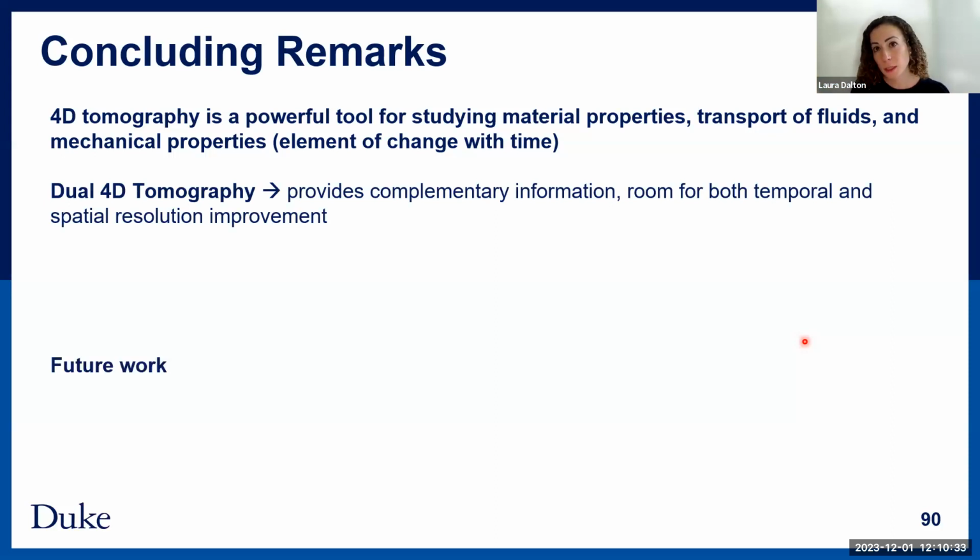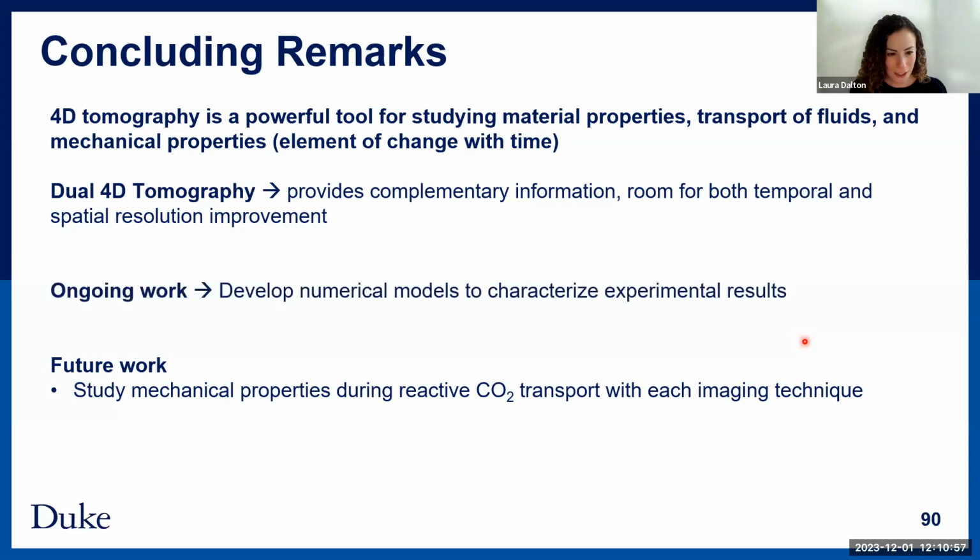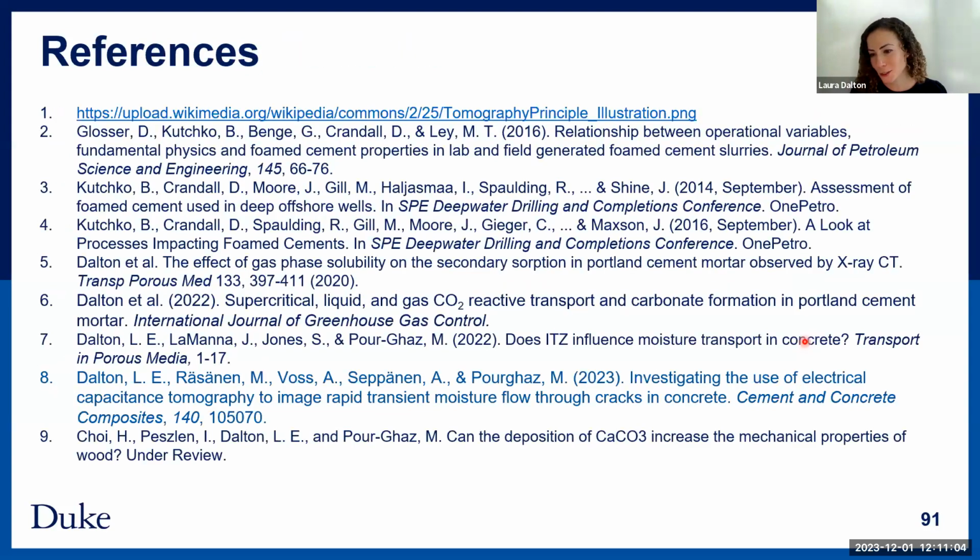But people have also done both electrical tomography and neutron, and electrical tomography and X-ray. There are tons of different combinations, just based on what you're interested in studying. Future work is really to integrate mechanical properties during reactive CO2 transport to really understand what's happening in the subsurface, but that's going to take some time. Ongoing work is my postdoc working on the numerical models, and we're just getting started with our system.